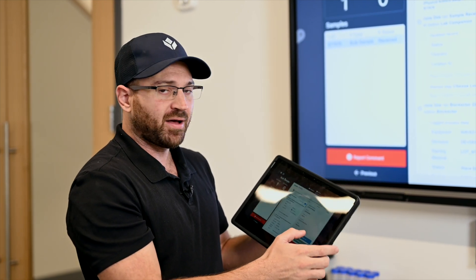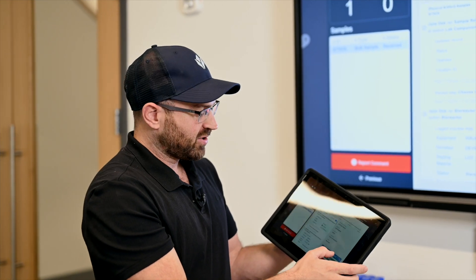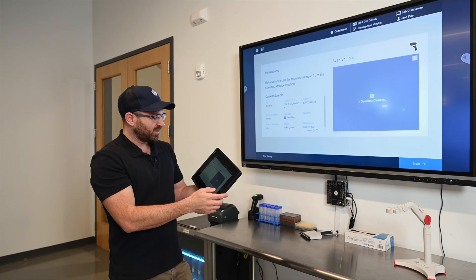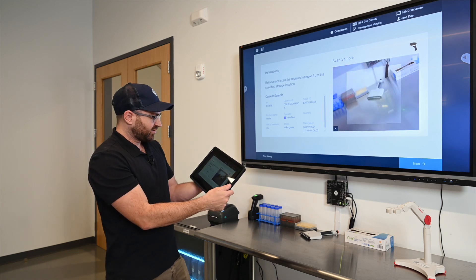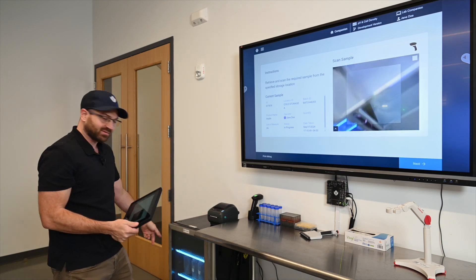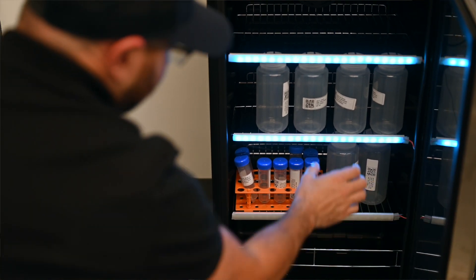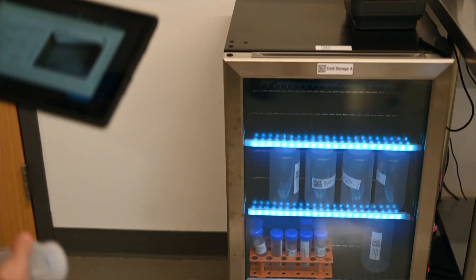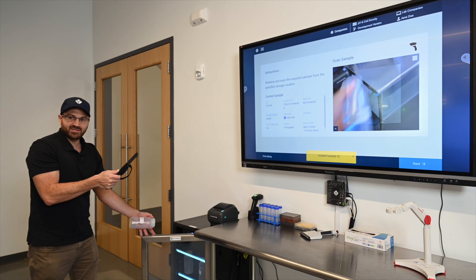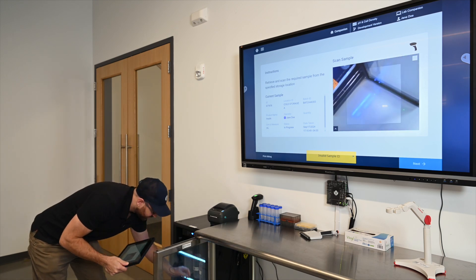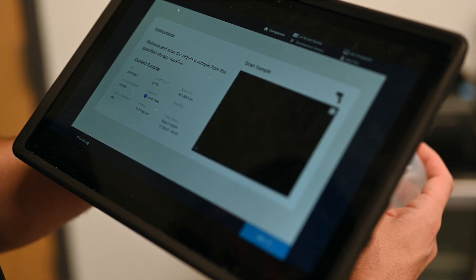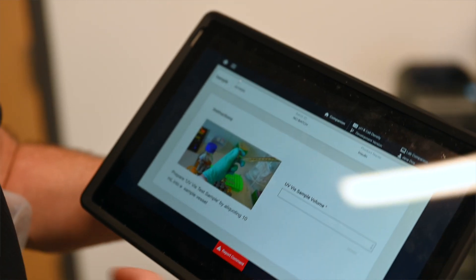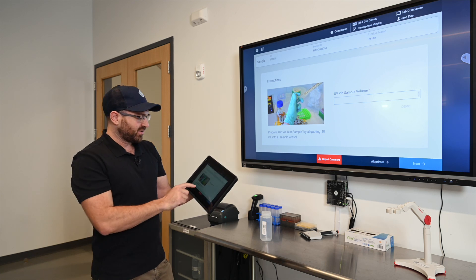I'm going to open up this application and I have to get this sample from the fridge. As a lab analyst I can see it's in cold storage A, it's lighting up the location. I'm going to grab this sample and if I grab the wrong sample it's going to say it's invalid. So I actually have to get the correct sample for this procedure and scan that. I've taken custody of this sample, it's now out of that location and I have to aliquot this into two test samples.